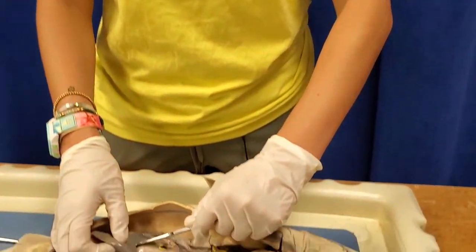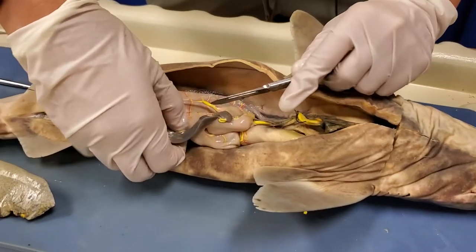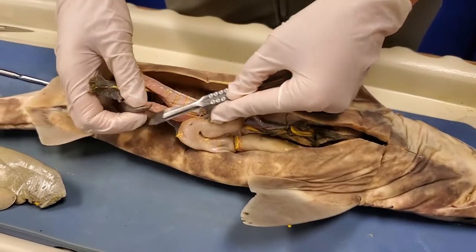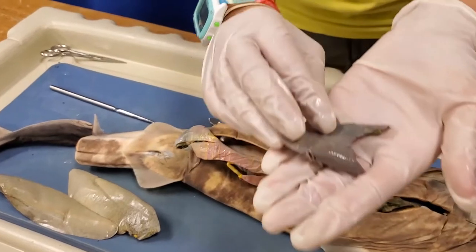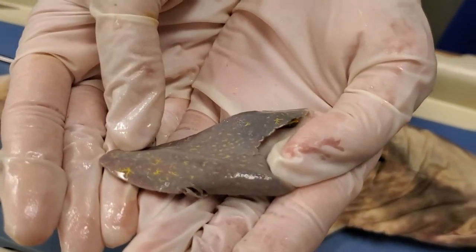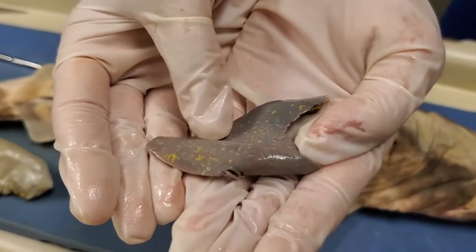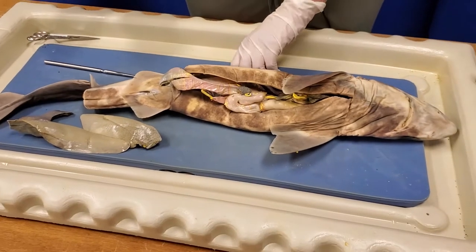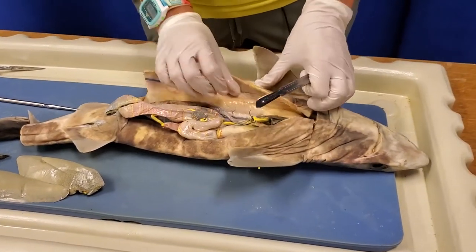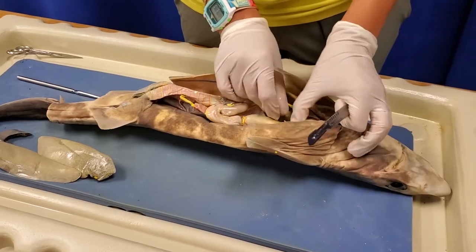Because humans have bone marrow, that's where we produce all of our red blood cells. But because sharks don't have bones the way you and I do, they have to produce their red blood cells elsewhere — they use their spleens to do it. You can see all that dye in the spleen — those are all blood vessels. The part responsible for producing blood is going to have a lot of blood vessels, so that makes a ton of sense.